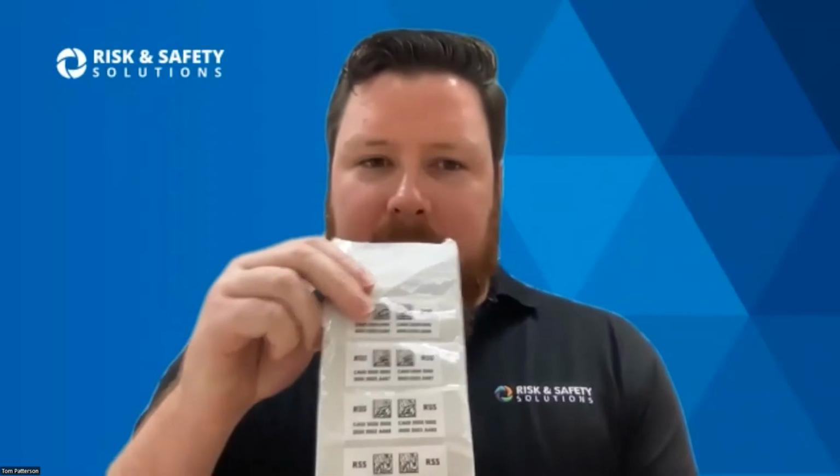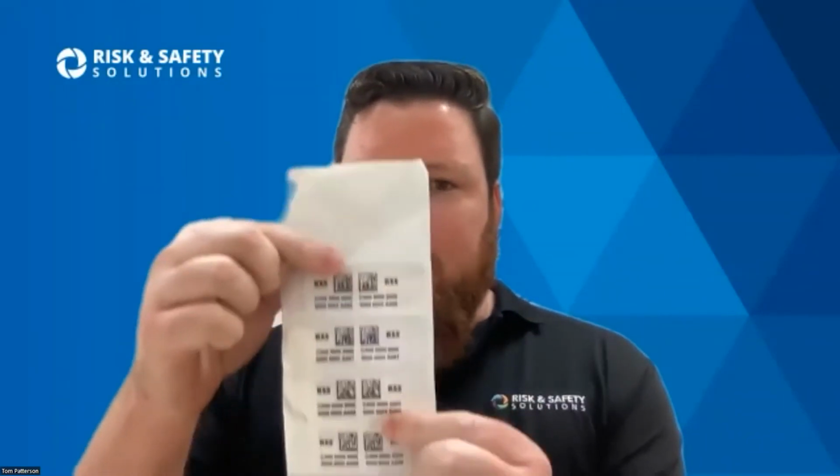I think, Tom, did you want to talk about what it's like to barcode stuff or about the barcodes? Just to kind of add on, because I have heard a question a lot from customers when I'm on site, which is, why did we have our own made up, right? And from our experiences, not all the manufacturers' barcodes on the actual bottle were unique across all manufacturers, right? And so that helped contribute to the decision for us to get these made with the RFID tags built in there.